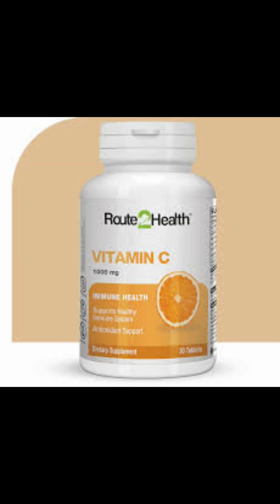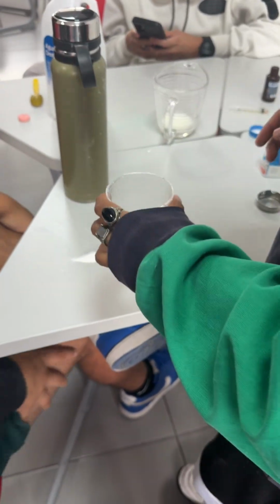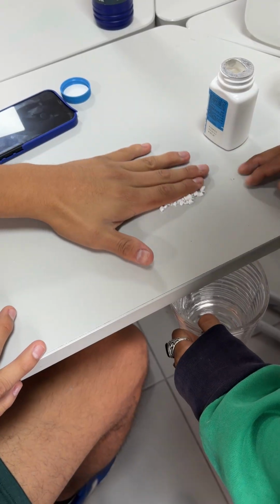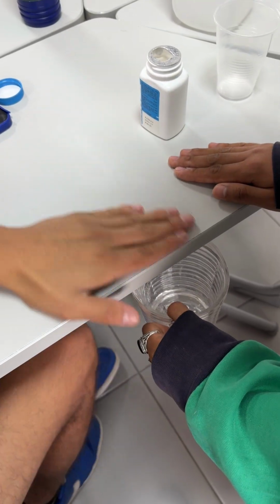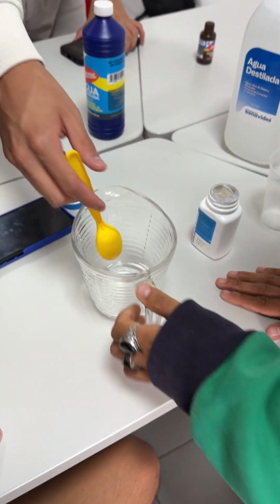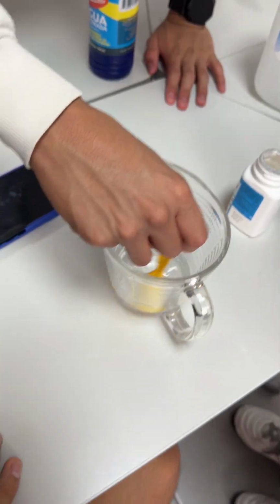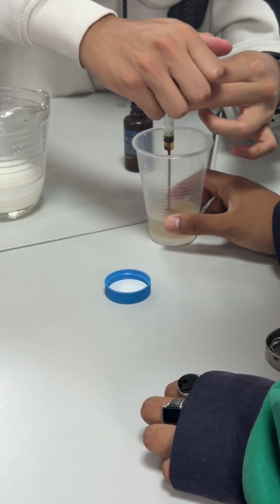First of all, we need to prepare the vitamin C solution. For this, we need to crush the vitamin C tablets into a fine powder, then dissolve this powder in 60 milliliters of warm water, then add 6 milliliters of iodine tincture and mix the water until the dark color of the iodine vanishes completely.